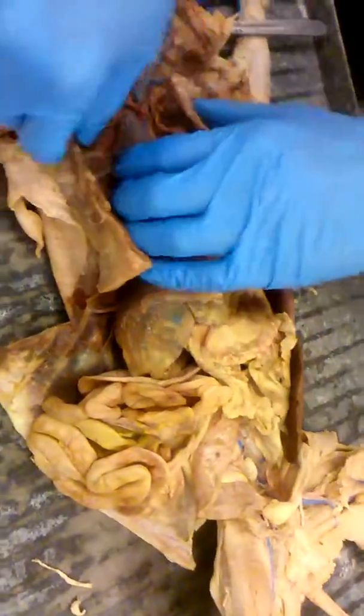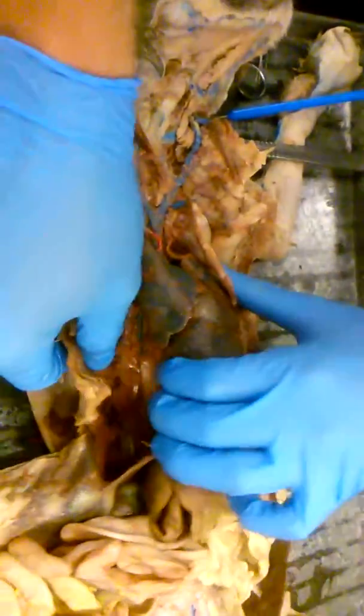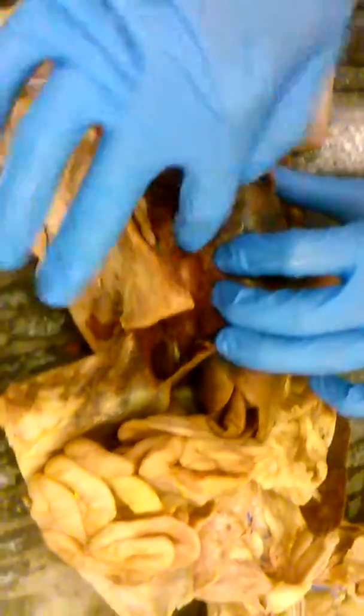But I'm just wondering, where's the azygos in the cat? I'll show you. Oh, yeah. It's under the rib right here. It's pretty easy to see. Oh, and there, that blue. So you'll see, might be better on this side. Anyways, all the ribs, can you see the little veins in between the ribs there?